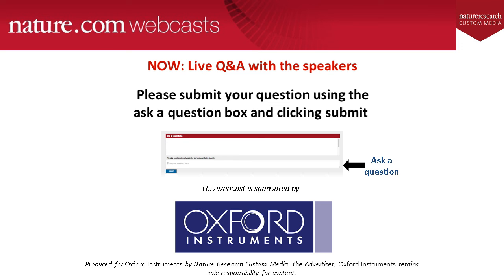Excellent. Thanks, Erin. Our next question is for you, Louise, and this one asks, how were the wear particle TEM samples prepared for EDS in an SEM?